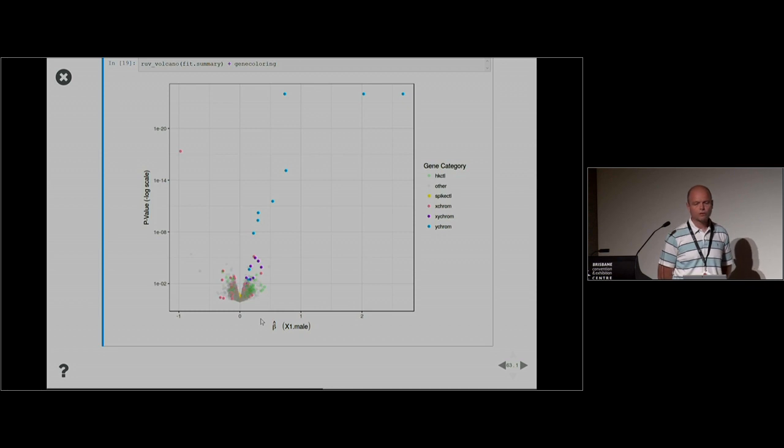What makes you say that it shrunk? Yeah, because there should be some genes that have very large differences. Well, here's a couple. There's only very little of that. Well, these ones, for example, have log-fold changes of over 2. Yeah, but typically, if you have 12,000 microarray probes, you only get several, maybe less than 10 different genes.